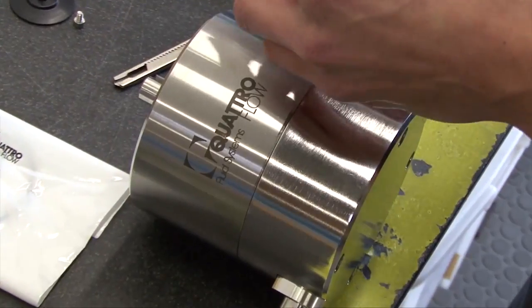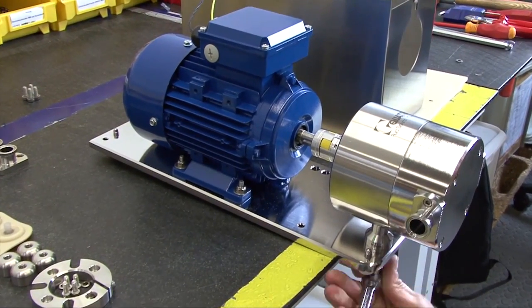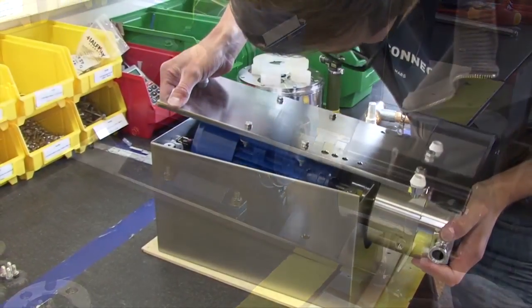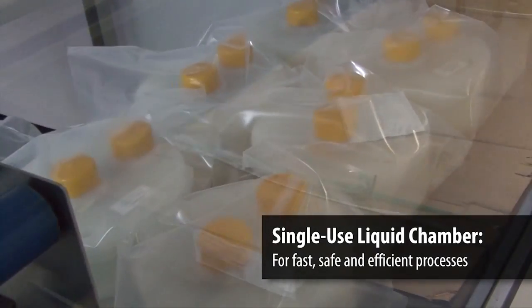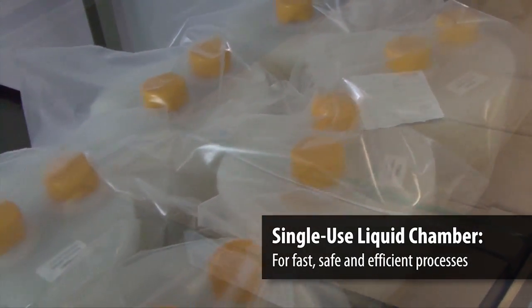Literally the heart of your system. Quattroflow quaternary diaphragm pumps, enabling your process. Also available with single-use liquid chambers for fast production when speed to market is of critical importance.